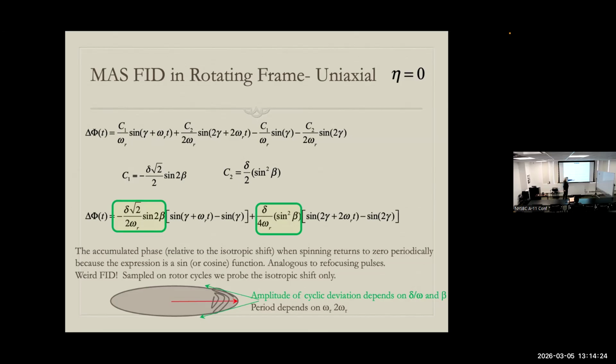And we're saying this would be the frame where I just sit there on my isotropic shift as a solution experiment would do. That's not what I'm doing. What I'm doing is I'm coming here and back here and here and here, sinusoidal. And it's clumsily drawn, but remember those other pictures we saw yesterday, we'll have a 2 omega portion and a 1 omega portion, so it isn't supposed to look like a perfect sinusoid.